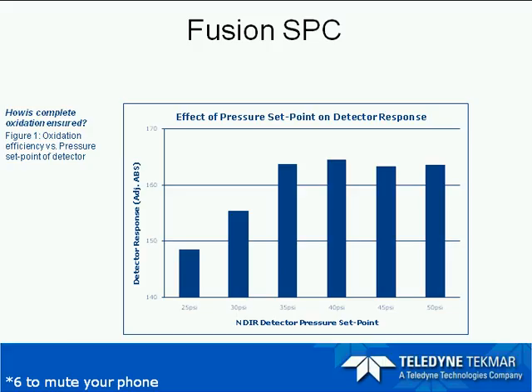Again, if you find that your samples and you're doing method development runs at a different pressure optimally, that's great. It's easy to do. This is to get you up and running to start the analysis. At 50 psi, we found, as you can see here, is an optimal pressure setting for most analyses.